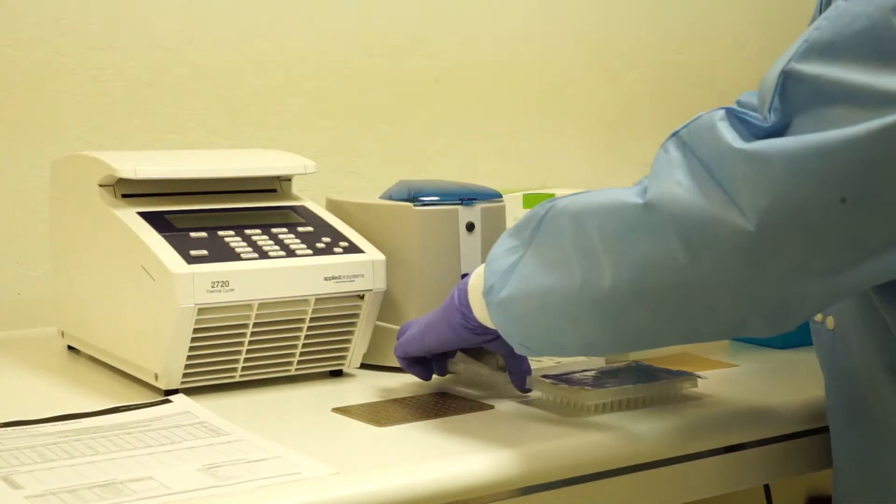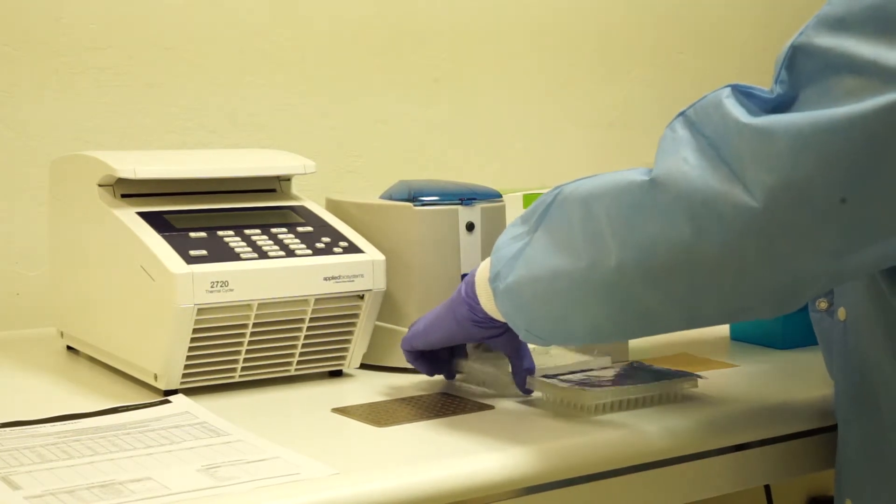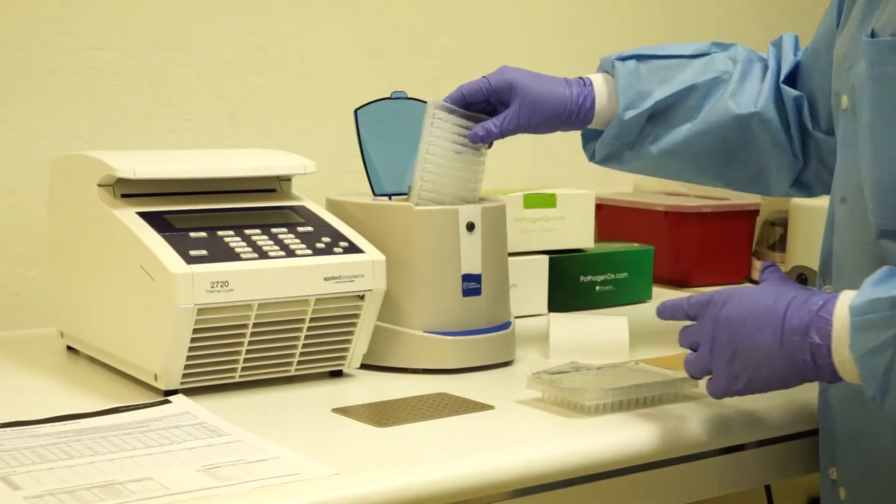Once you have sealed your labeling PCR plate, place in the centrifuge and briefly spin down.